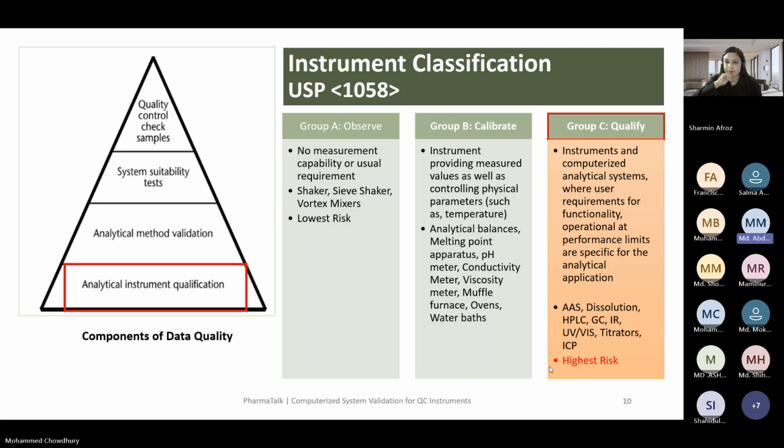This software is not related to any kind of instrument or system. The software itself is installed on the PC and we use it only for statistical calculation. So for validating this software, what measures should we take? Because it is not related to any instrument, I just want to know what parameters we should select for the validation. Will it be okay to select the roles and all the stuff, or other things?